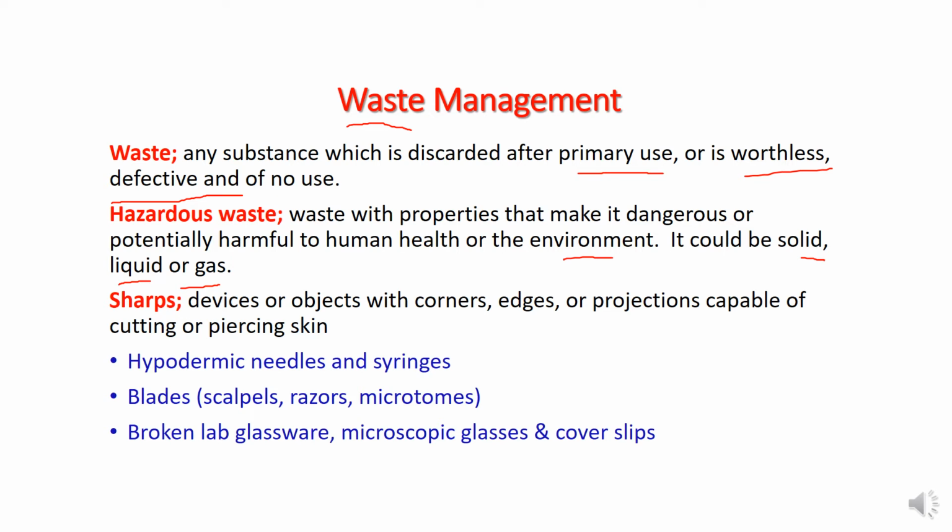And of course sharps. These are also a big source of waste in hospitals, clinics, and especially in the college of medicine, and also in other biolabs where we use different syringes and objects that have edges or projections, like needles and glass pipettes. There are certain other cutting or skin-piercing equipment. Examples are hypodermic needles and syringes.